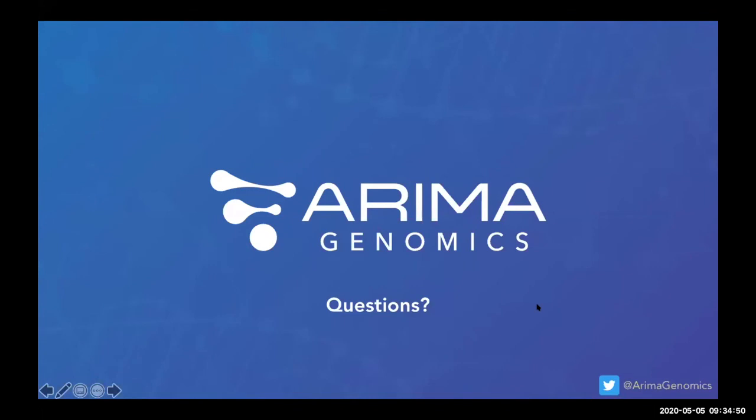Sure. So the upper limit we recommend for the genome-wide Arima Hi-C or Arima Capture Hi-C is actually really limited by the amount of chromatin that's in the cells that you put into the assay, because effectively the chromatin within the nuclei is the substrate to these enzymatic processes. And we try to work with about 5 micrograms of chromatin within those cells or less.